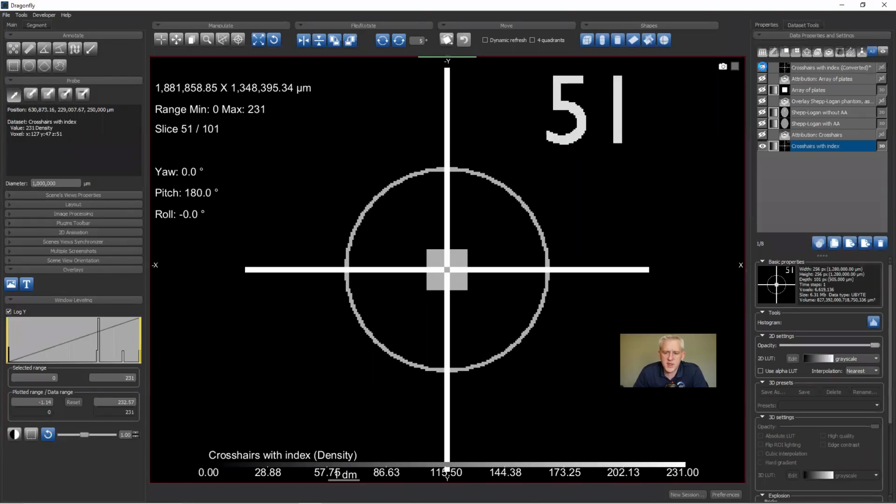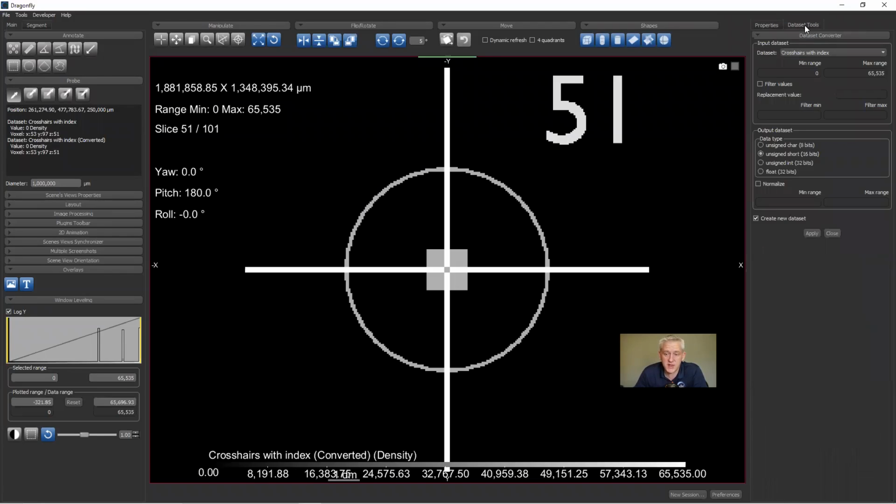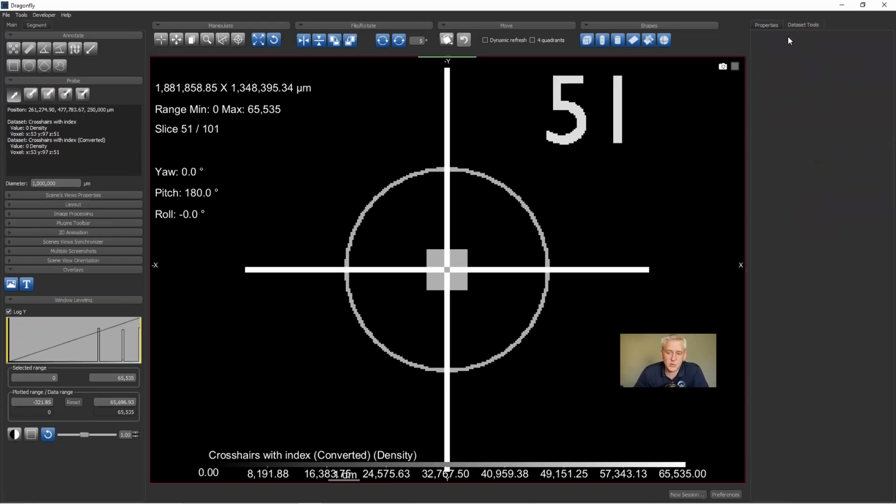And if we now turn that image on, it's going to look the same, but now it's going to be scaled. If I select it, you'll see it's scaled on a different scale. And so if I do the probe here, you can see that my initial image still has an intensity of 231, but the converted image has 65,000. If I go in here, initial image 121, converted image 45,000. So this is rescaling the intensities when you have that checkbox normalize turned on. So I don't want to get into this. This is if you need to convert from float to char, or from char means the same as byte, or from byte to float or to U short, this exists and this is where you can find it.